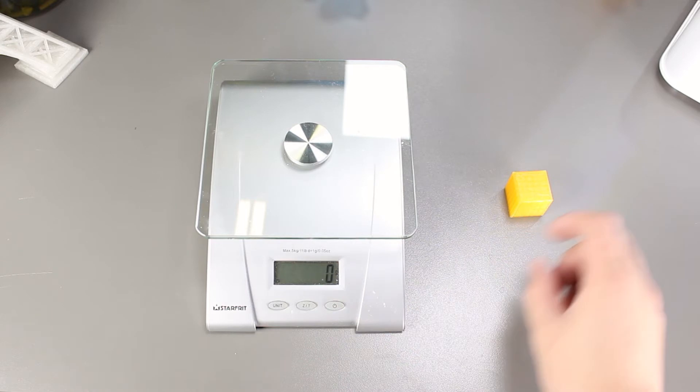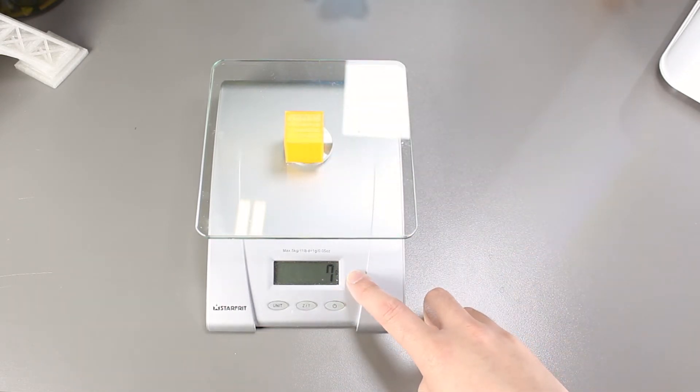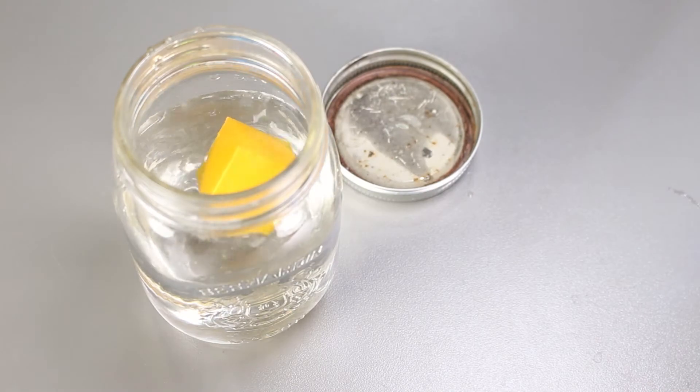We will weigh the PLA first. It weighs 7 grams right now. Now let's put it back in the mason jar full of water, let it soak up the water for an hour, and then we will take it out and weigh it again.